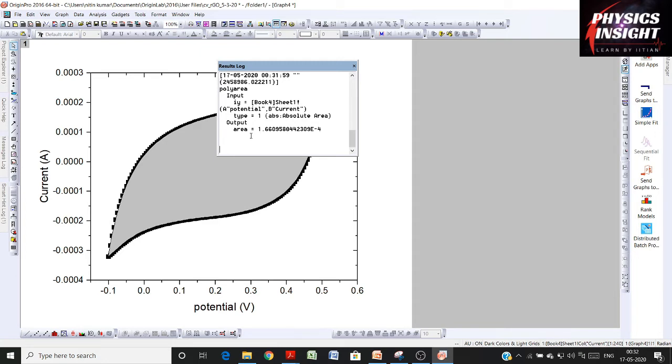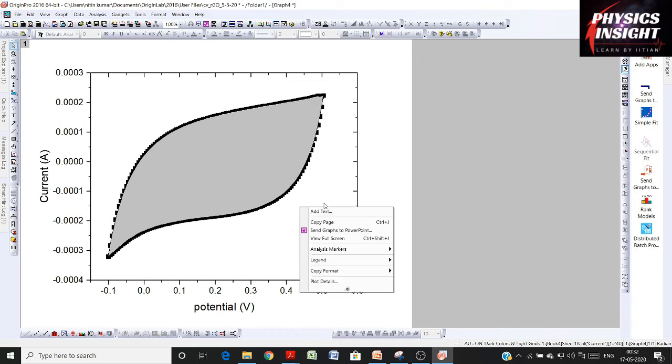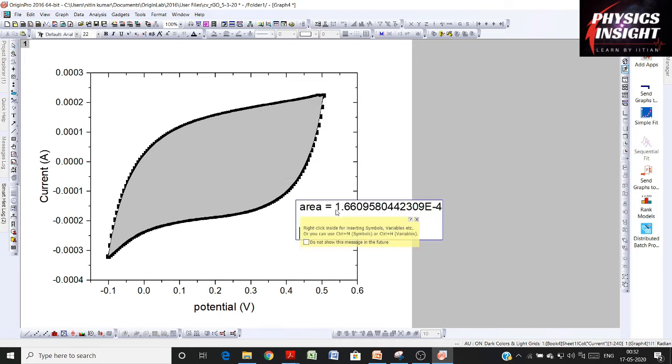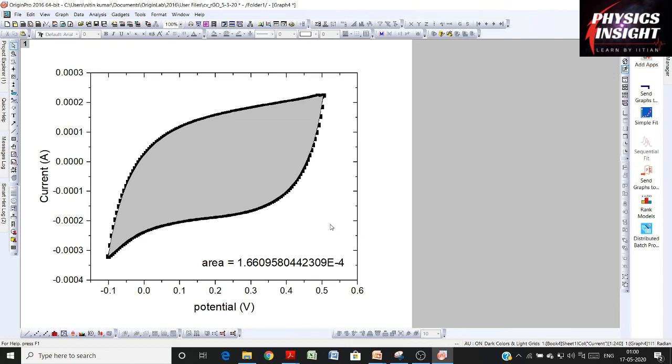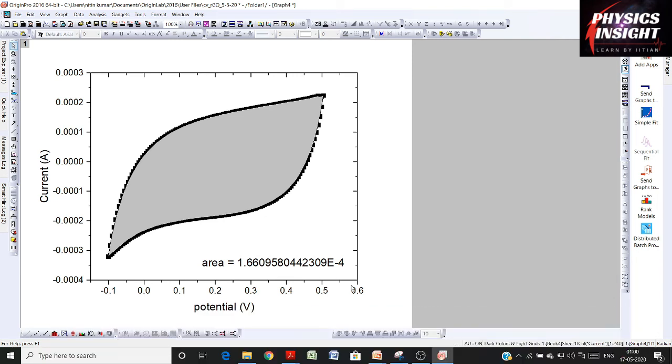Using this value of area in the expression, we can calculate the specific capacitance for our material. Let's copy this value and paste it here. In this plot, we also see that our potential window is from -0.1 volt to 0.5 volt, so our potential window (ΔV) is equal to 0.6 volt.